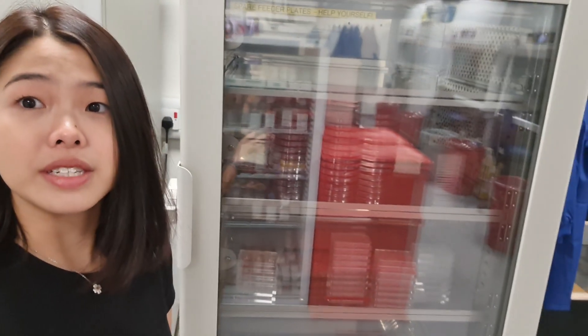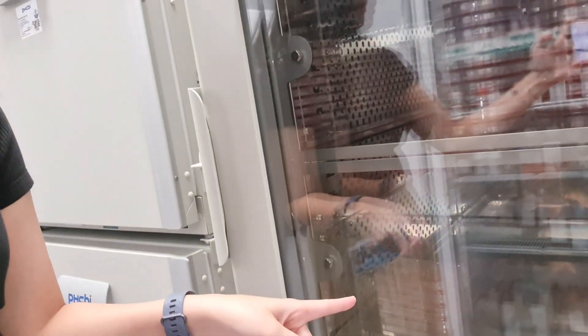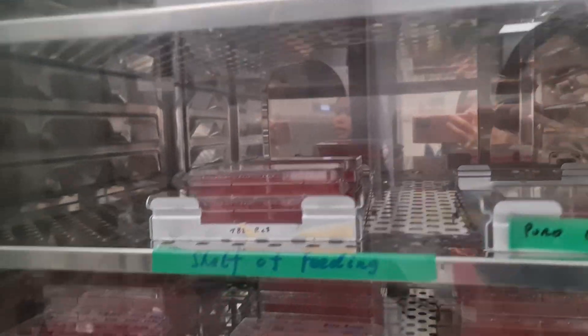We keep our feeder cells in this big incubator over here — those huge 15-centimeter plates. We're expanding them to be irradiated later on next week. Those over there are already our irradiated feeder cells, ready to be used for any ES cell plating, thawing, splitting, or micro-injections. In a separate incubator we have our ES cell clones, and all of these are things I need to change media for today.